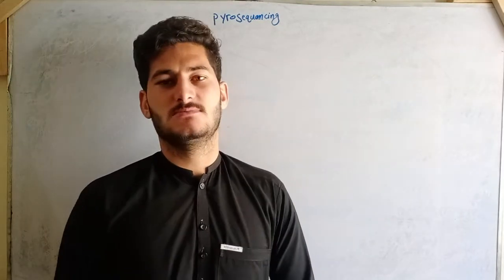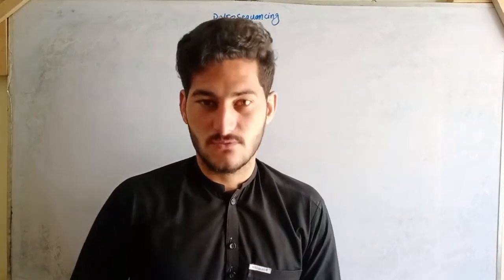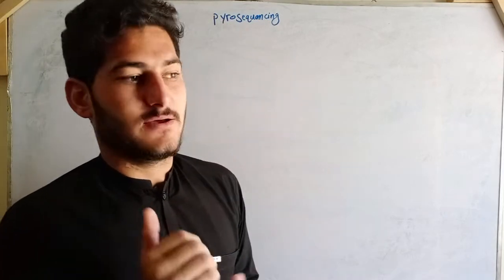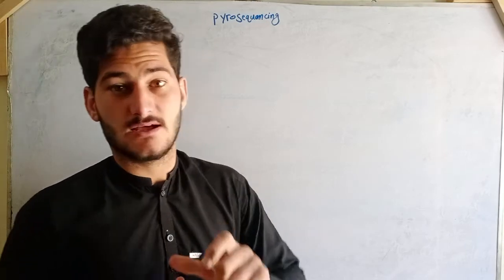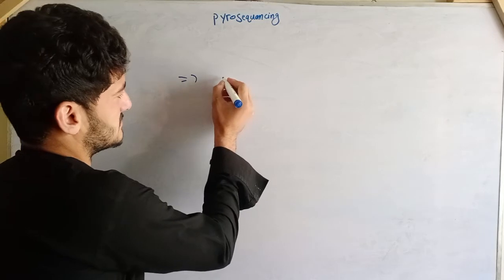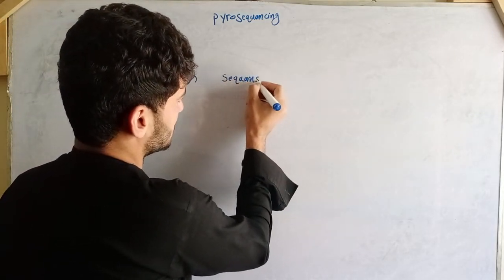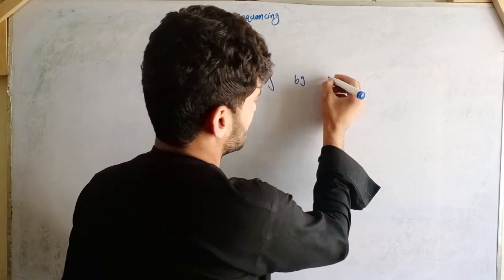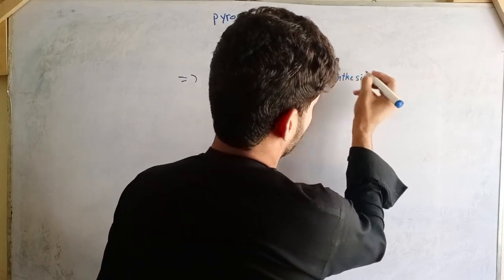So pyrosequencing means to remove pyrophosphate from the addition of nucleotide. Basically, this sequencing depends on sequencing by synthesis.